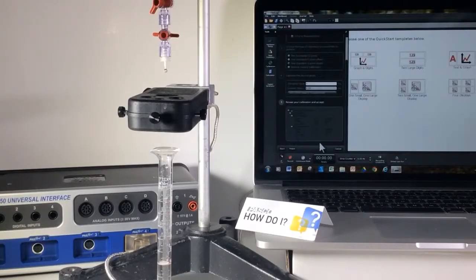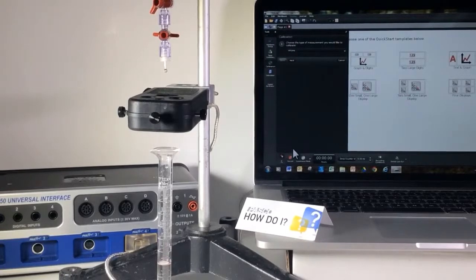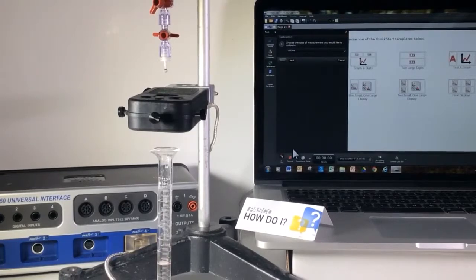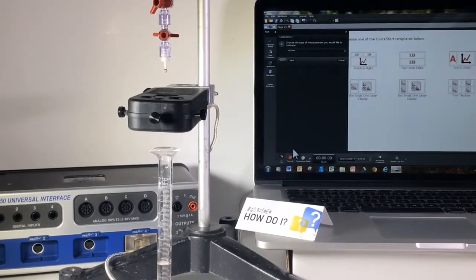Hit next and finish. I'm now calibrated and ready to use in the classroom. Thank you.